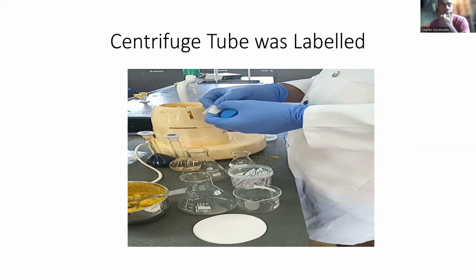We are working with 6 repetitions, since we have food samples from 6 days, so we will be doing 3 runs of 6 to test for nitrite and nitrate, in order to extract an amount that is testable.